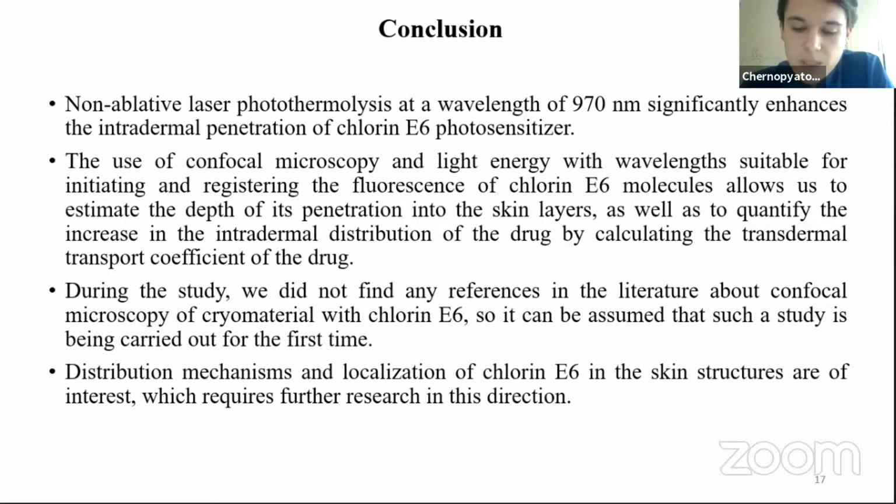During the study, we didn't find any references in the literature about confocal microscopy of cryo material with chlorin E6, so it can be assumed that such a study is being carried out for the first time.